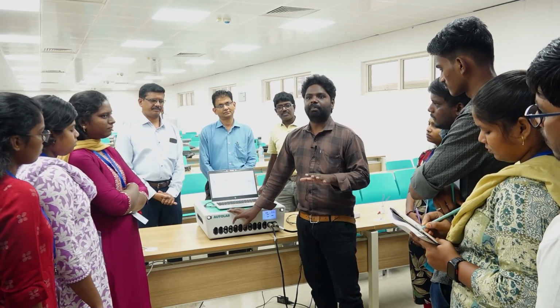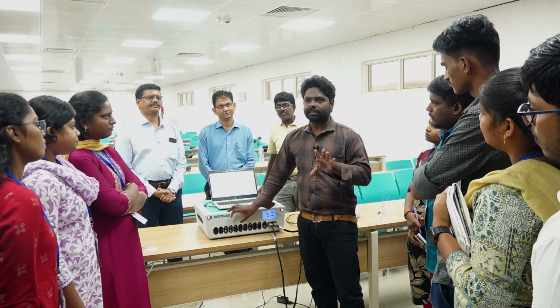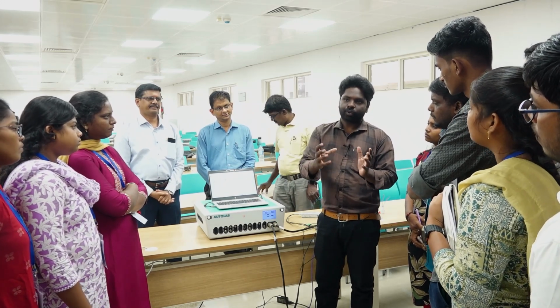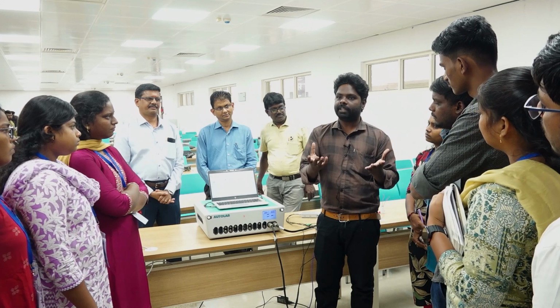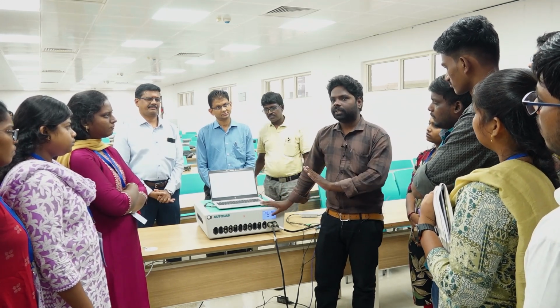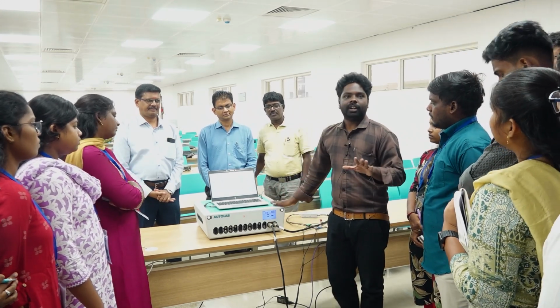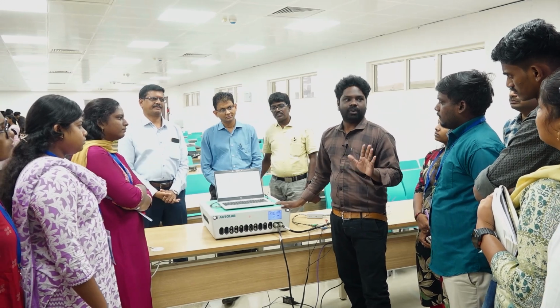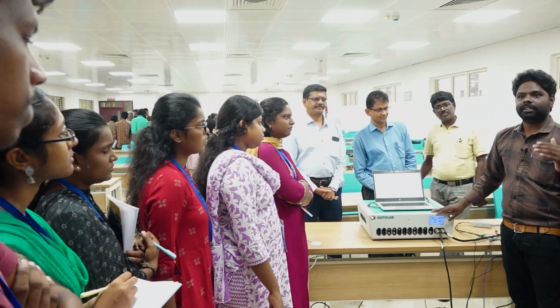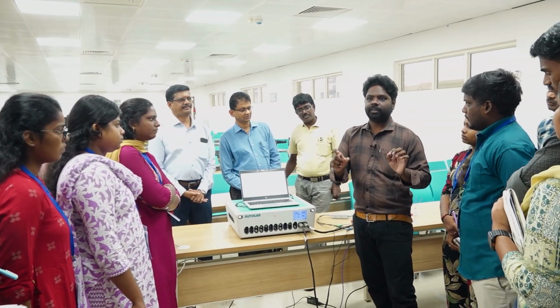Nowadays many analyses require an electrochemical process. Suppose you want to characterize or analyze a material, then we need electrochemical equipment. This is one of the electrochemical equipment from the Metrohm brand. Today we are going to cover EIS. Hope you have heard about EIS, or if you are new to EIS, no issues, we will start from scratch. I hope this session will be brief and crisp.